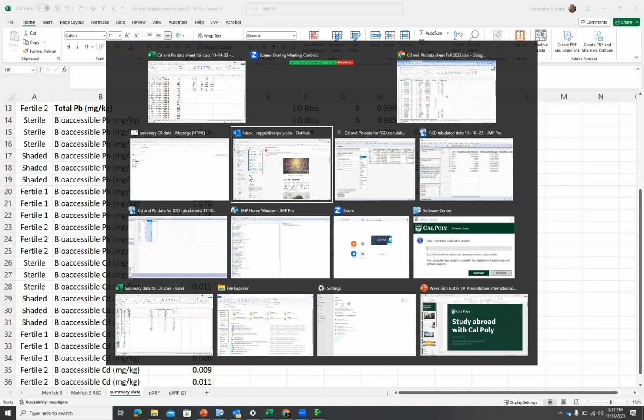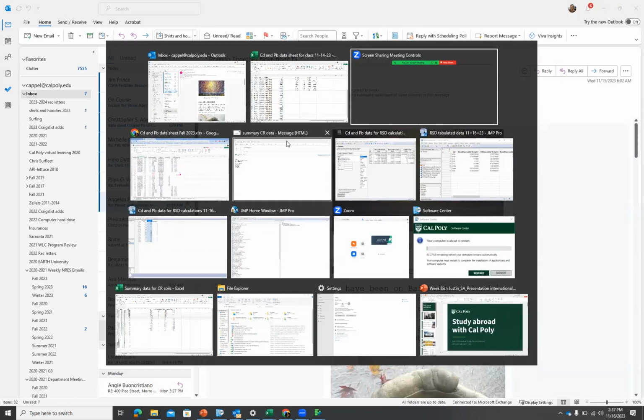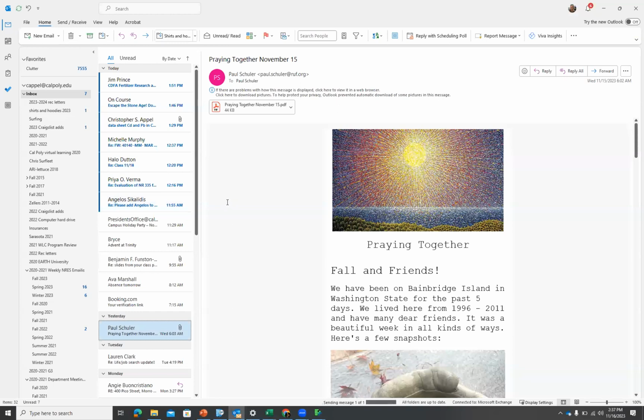Okay, but my point in all this is that you've gone through it once and you've seen it, and so you have an idea of how to do it. Let me just find that email. There it is. Okay, so I just sent it to you. It has a spreadsheet that has that data on it there.